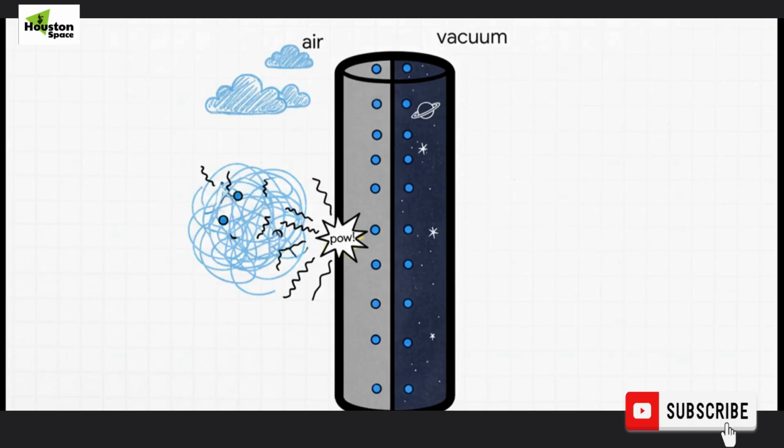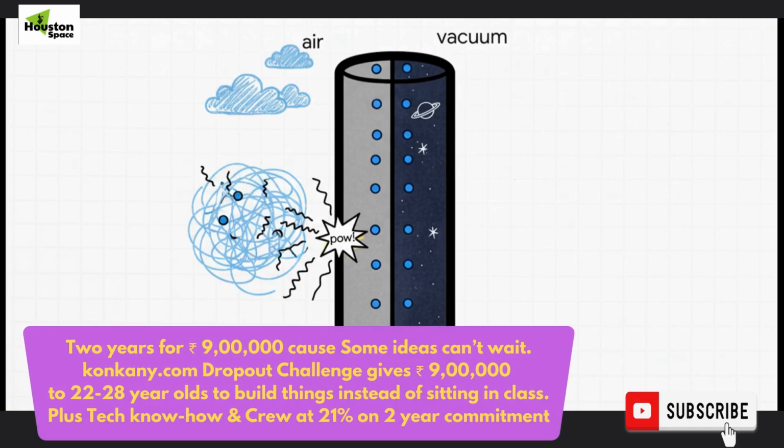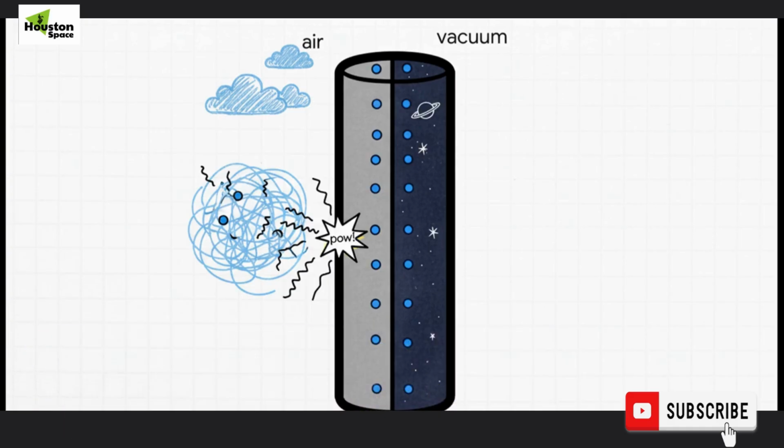Oh, and get this. Here's a crucial detail that's just wild. The entire column where all this magic happens has to be a near perfect vacuum. We're talking outer space conditions. Why? Well, if even one of those super fast electrons bumps into a single stray air molecule, it'll get knocked off course and completely wreck the image. So yeah, the whole trip happens in a total vacuum.